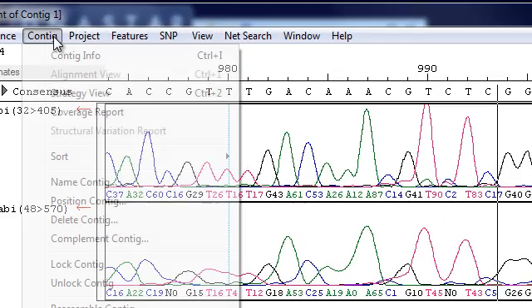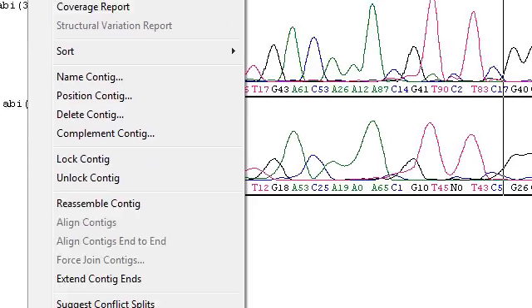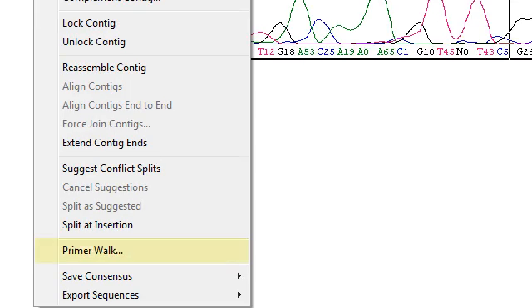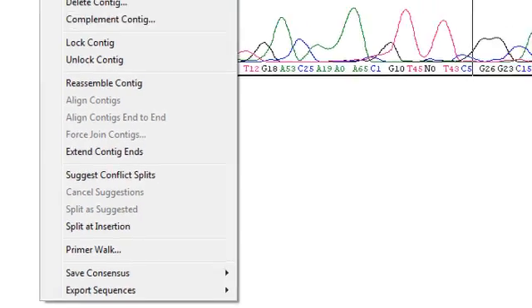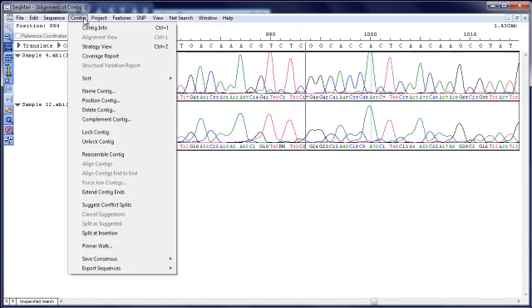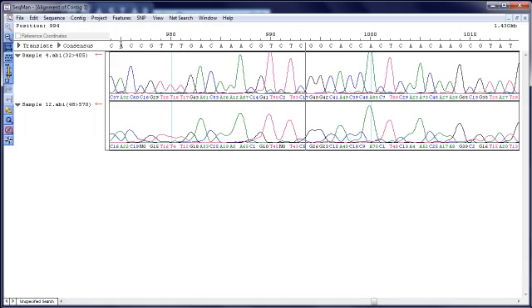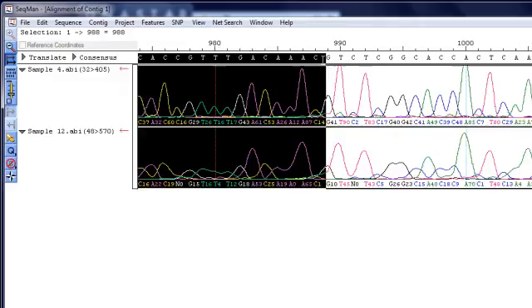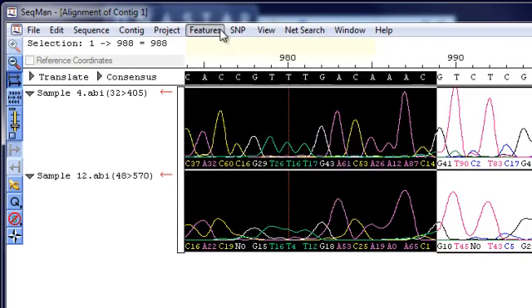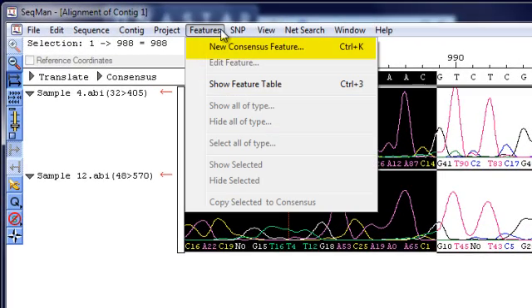You can use SeqMan Pro's primer walking feature to design primers that walk into areas of low coverage or gaps. We have another video on our website that shows this workflow in detail. You can also annotate your contig by selecting a region and creating a new consensus feature.